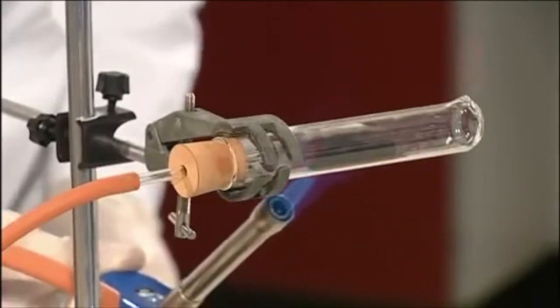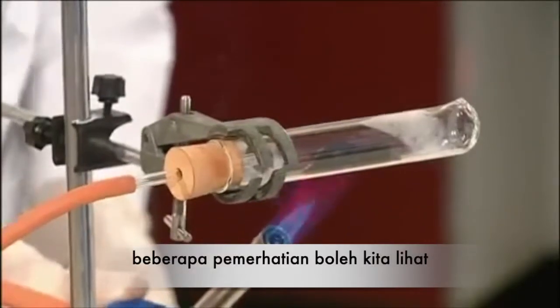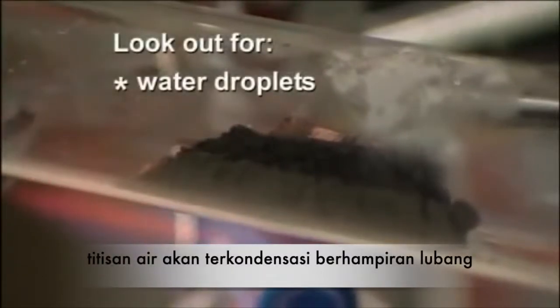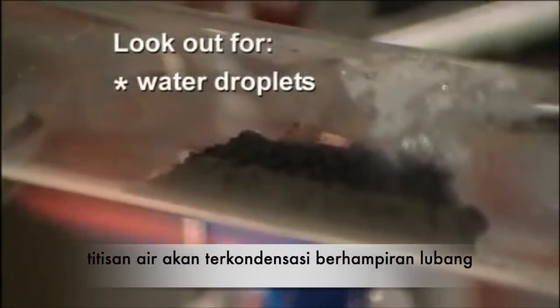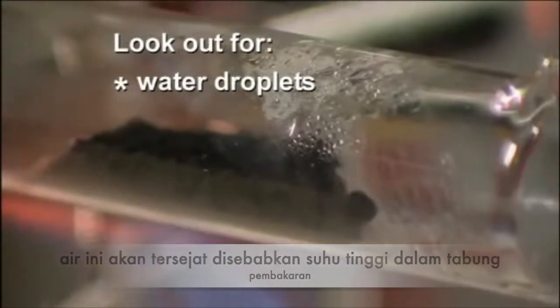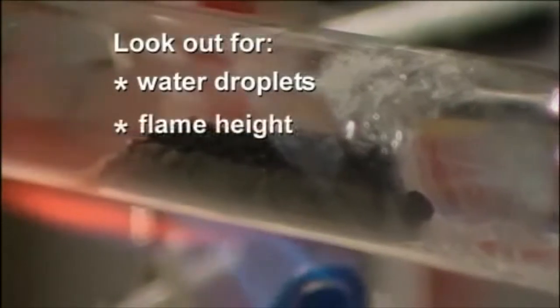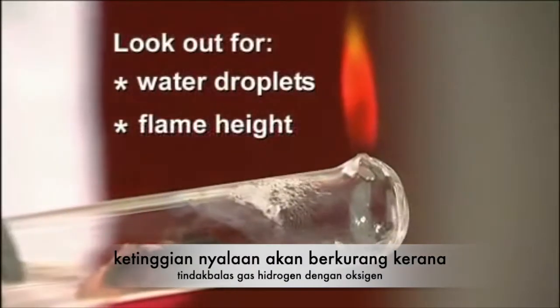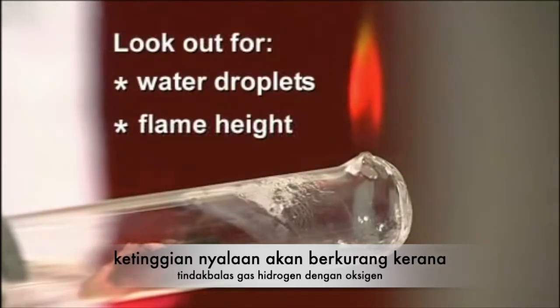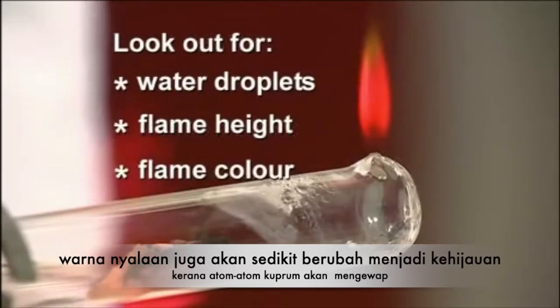At this point, a number of interesting observations can be made, and these will probably need to be pointed out to the audience. Droplets of water will condense on the cooler part of the reduction tube near the hole. These will evaporate as the tube gets hotter. The height of the flame will drop as some of the hydrogen is used up, reacting with the oxygen in the copper oxide. The flame may develop a green coloration caused by copper atoms vaporized into the flame.